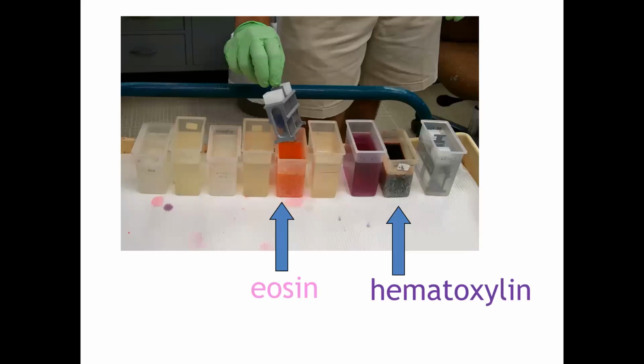So this is the staining process. Again, this can be done manually or by a processor. In our lab, we do this manually, okay? So here, again, you use xylene to dissolve the wax, then you use alcohol, and then finally water, and then you use eosin and hematoxylin baths, right? This is eosin, this is hematoxylin, this is eosin, right? These are the slides which are placed in this rack, and you can dip the rack into these staining baskets. You stain them for a regular time, and then you wash with water, and finally you have slides which are stained with hematoxylin and eosin, right?